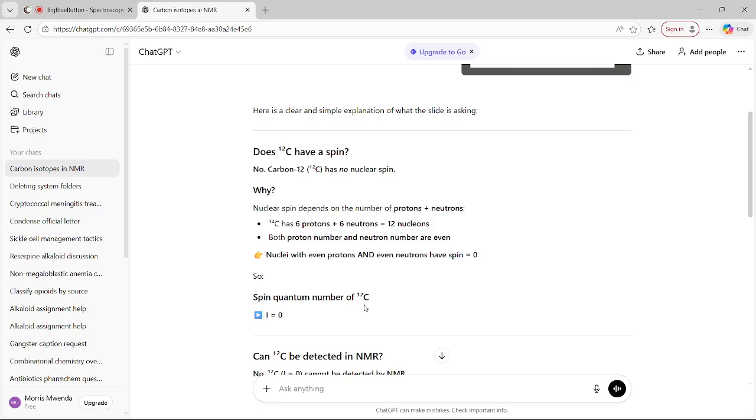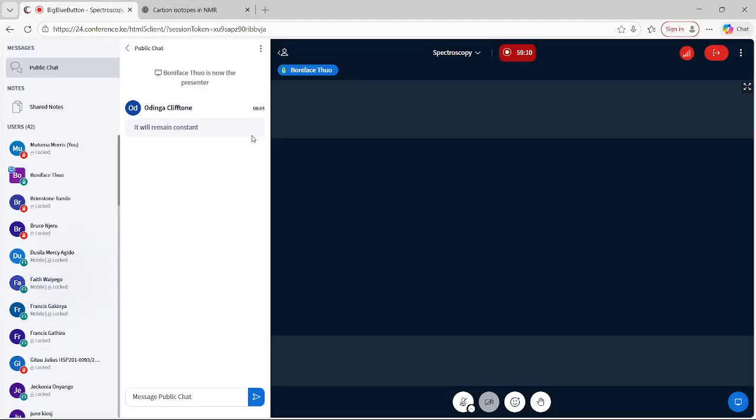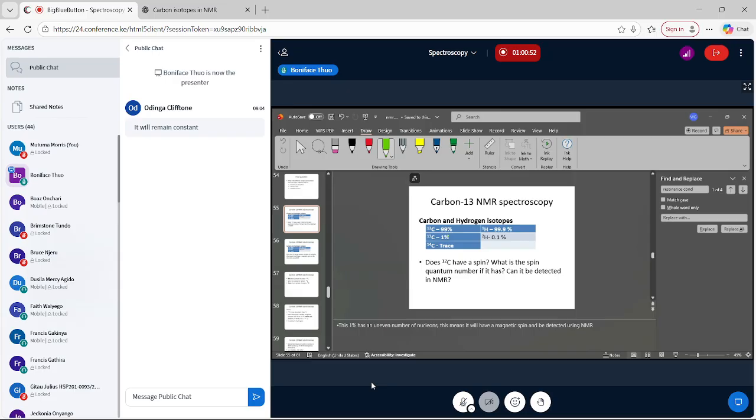That is why, unlike the continuous wave method with hydrogen, a special technique which we call the free induction decay or the pulsed NMR technique is required to carry out carbon-13 spectroscopy, which allows the addition of spectra and therefore increases the sensitivity.